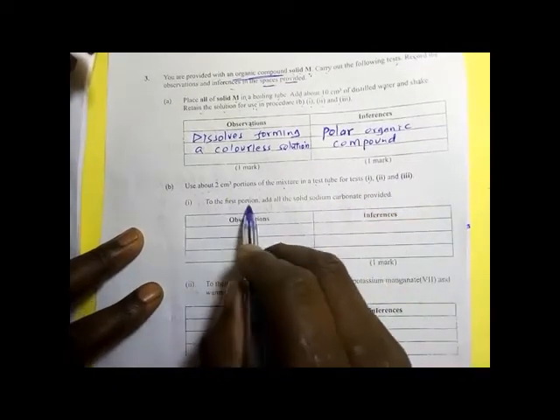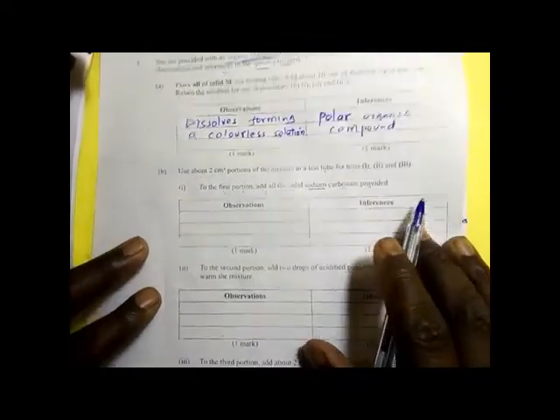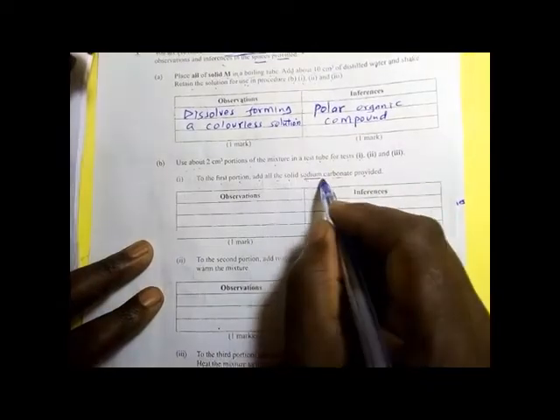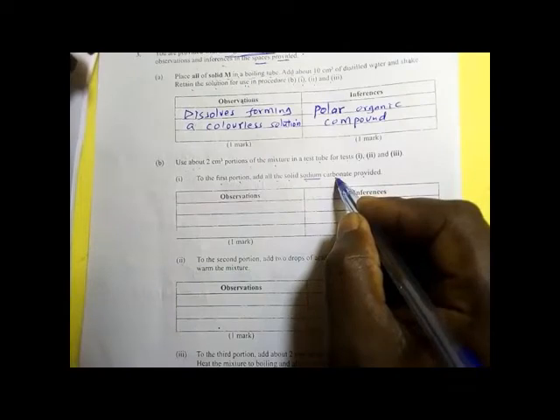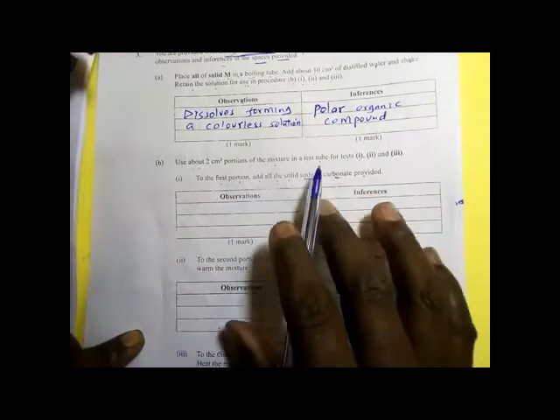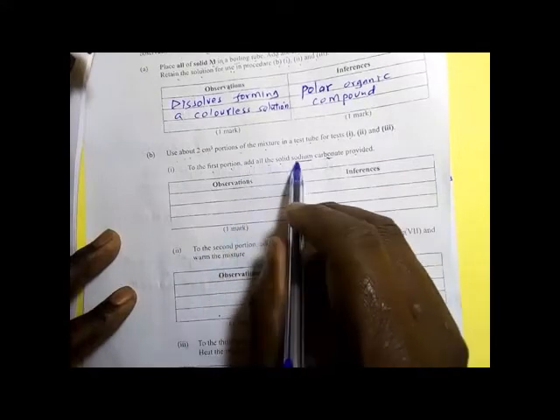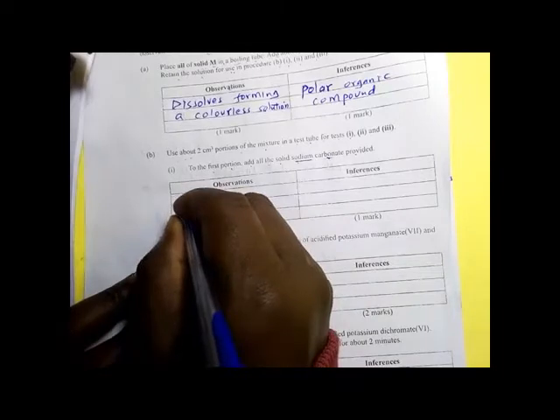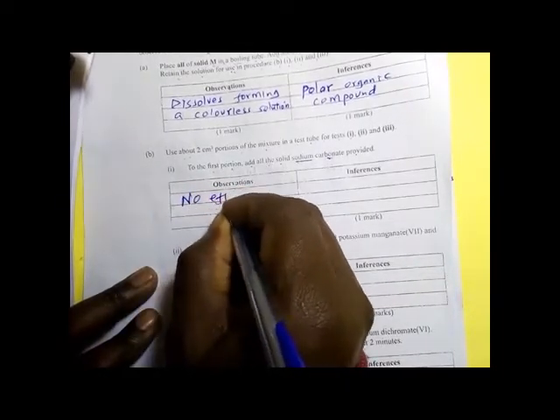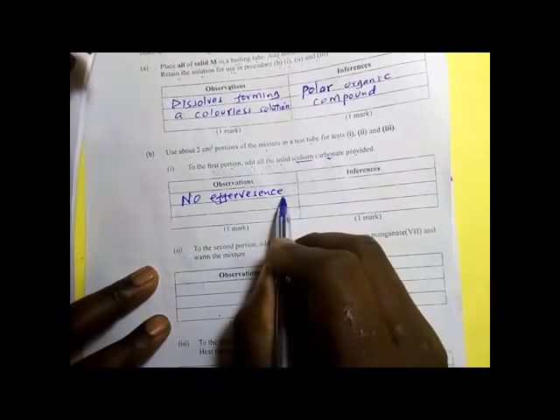So, to the first portion, add all solid sodium carbonate provided. I have always told you that whenever you are adding sodium carbonate, this is a carbonate. If the solution is an acid, you will expect effervescence. If the solution is not an acid, you will not see effervescence. So here, in this case, there was no effervescence.